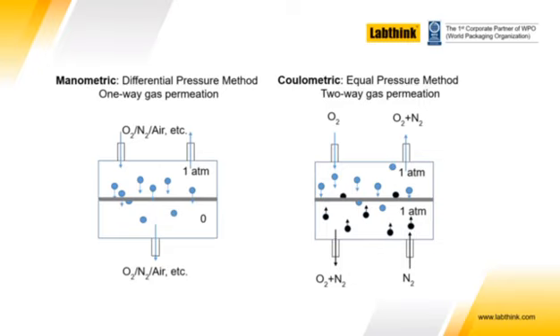And so the propensity is for the oxygen to move from the upper side to the lower side. But in the same principle, you have this high concentration of nitrogen on the lower side and none on the upper side. And so there is the capability or the principle of permeation to take that nitrogen from one side to the other.